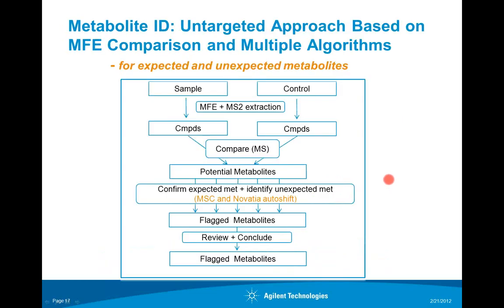So to ensure the Quan workflow is highly efficient, a good software package is equally important. So in the next few slides, I will briefly discuss how MassHunter software can facilitate the data processing for both quantitation and metabolite identification.